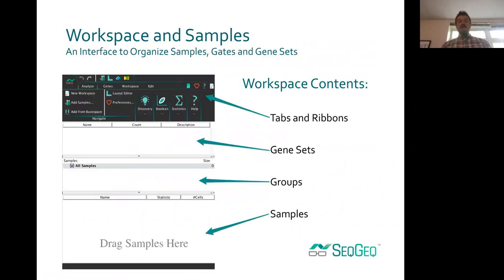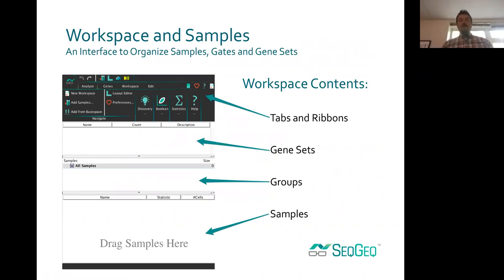Overview of what I'm going to be talking about today: starting with the SeatGeek workspace, the basic starting point of any analysis. If you're familiar with Flojo, it should look familiar. Essentially we have tabs, ribbons, and the gene sets area, which is a little different than what you'd normally see in Flojo — they're at the top of the workspace.